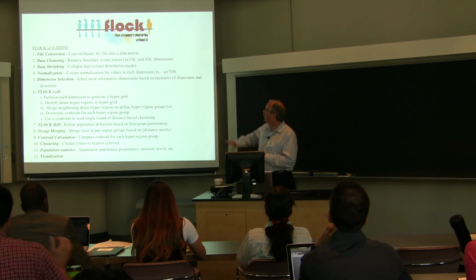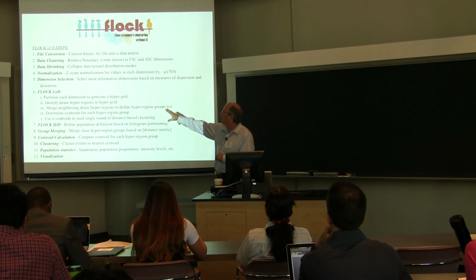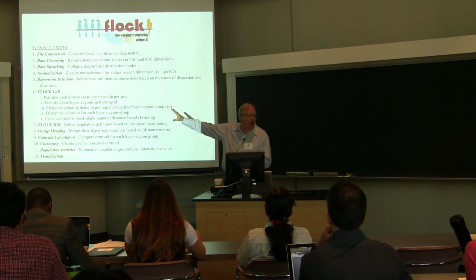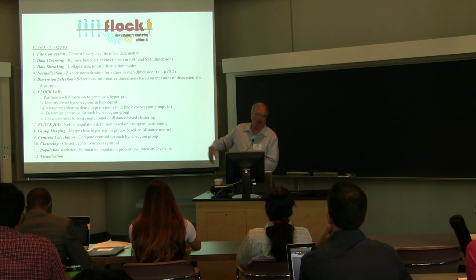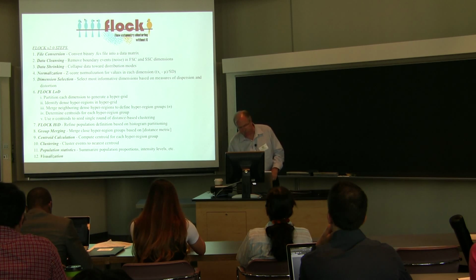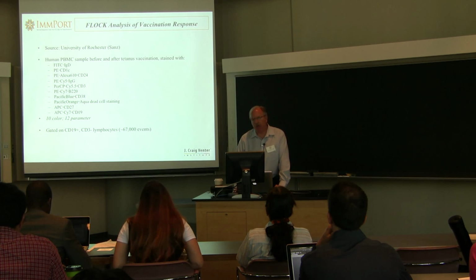So this is, I think, in addition to developing the core of the algorithm, really to get it to work well in real-life samples, we have to incorporate this into this kind of a data processing workflow. So I'm just going to show you one example of what the data looks like when you analyze with FLOCK.